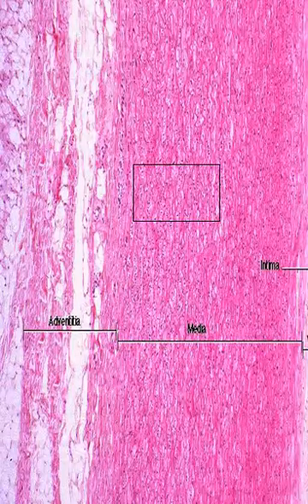Here we should notice the tunica media consists of circularly arranged smooth muscle and abundant elastic tissue. We should be able to notice the elastic lamella, but not with this magnification.